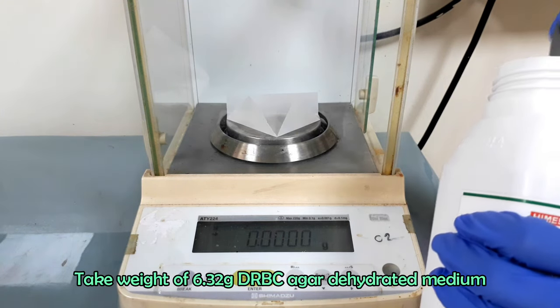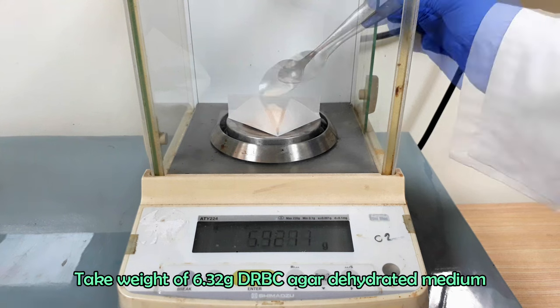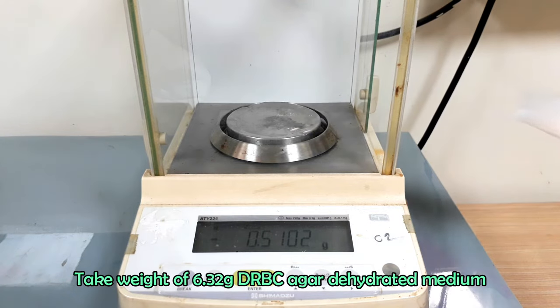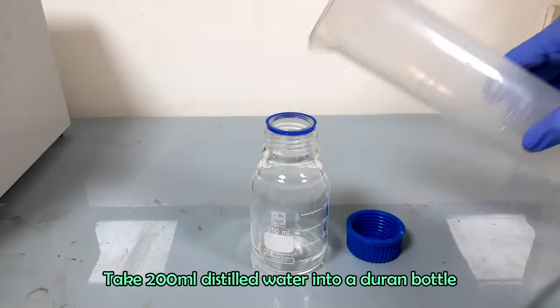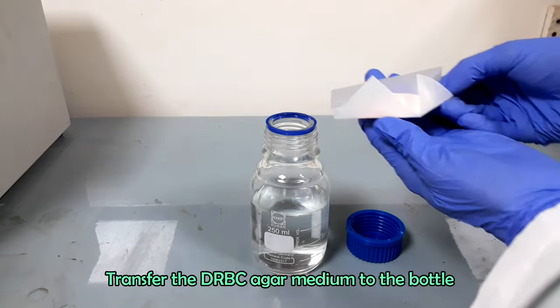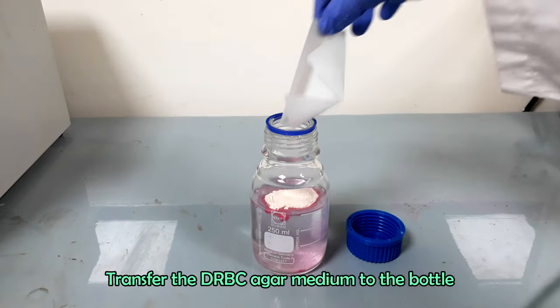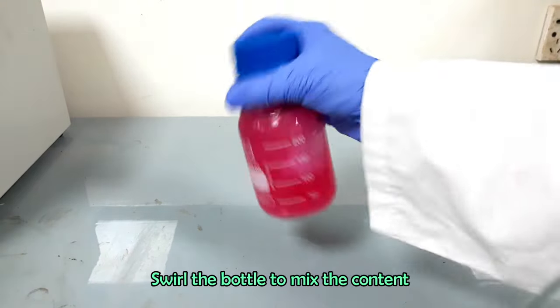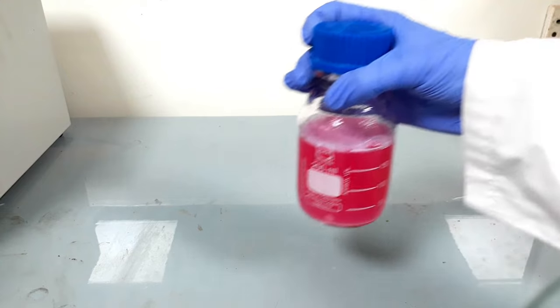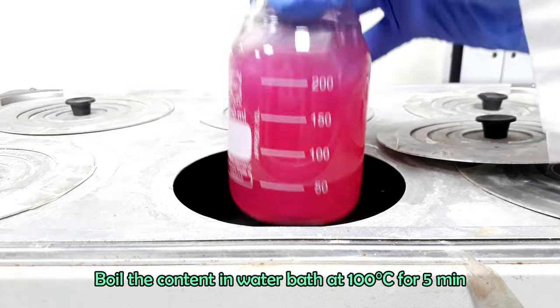Take 6.32 grams DRBC agar dehydrated medium. Take 200 ml distilled water into a Duran bottle. Transfer the DRBC agar medium. Boil the content at 100 degrees Celsius using a water bath with occasional swirling.